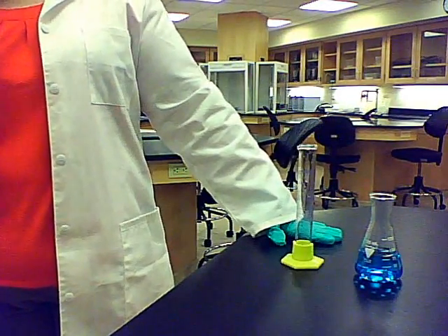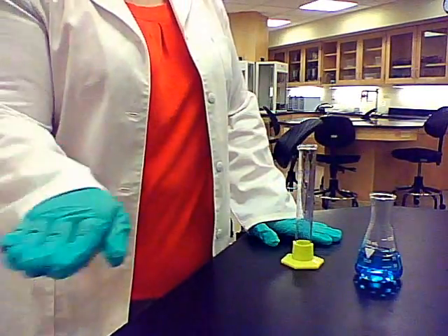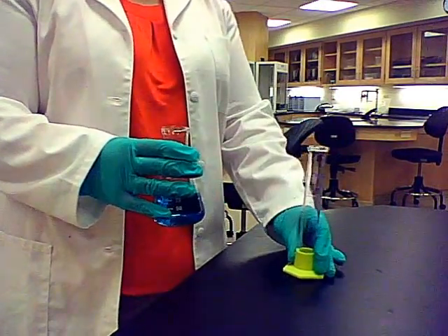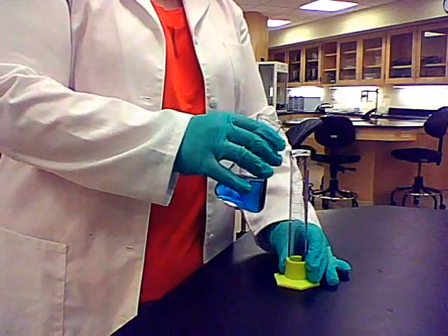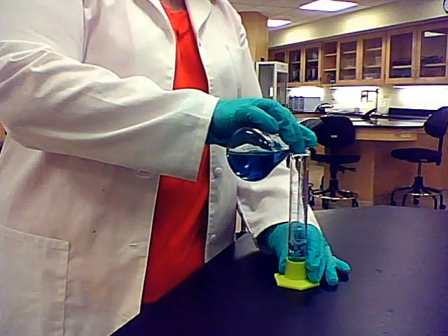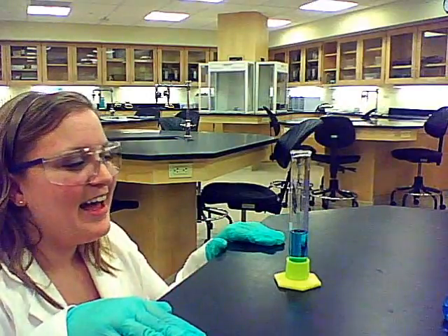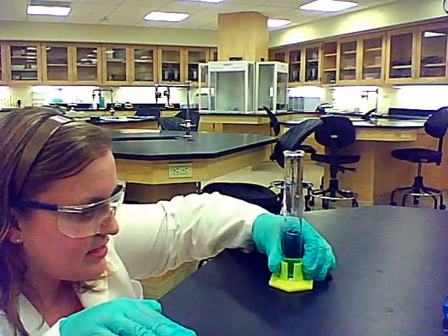In most laboratory environments, you will be working with concave meniscuses, again working in the U shape, and you want to read from the bottom of that U. You want to pour your fluid into the graduated cylinder. The graduated cylinder has tick marks on the side which let us know what volume is in the cylinder. When you read a graduated cylinder, you want to read it so you're perpendicular to the fluid level. This helps us get a correct reading. And again, you want to point the tick marks to you.